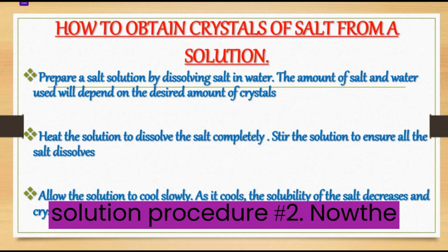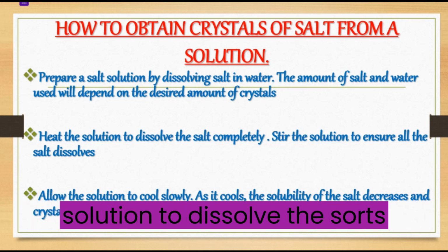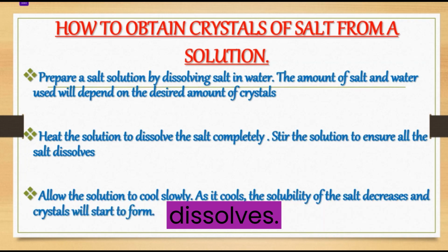Procedure number two, now the solution that you have formed in procedure number one, you heat that solution to dissolve the salt completely. You also stir the solution to ensure that all the salt dissolves.